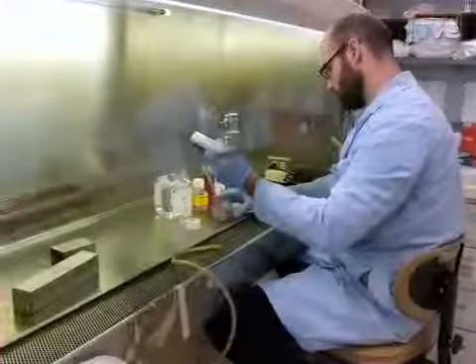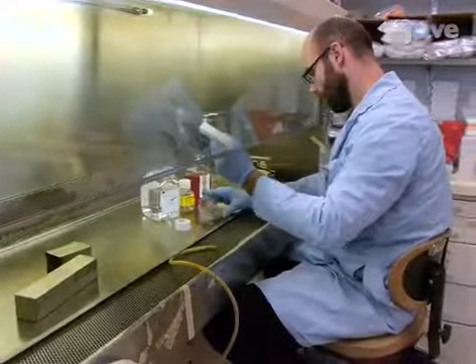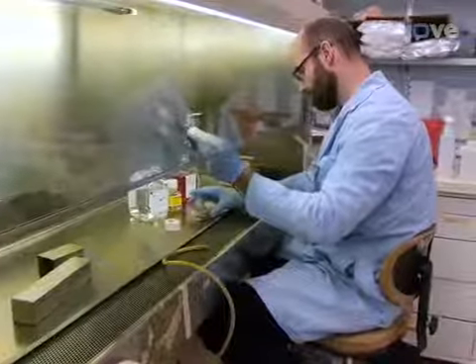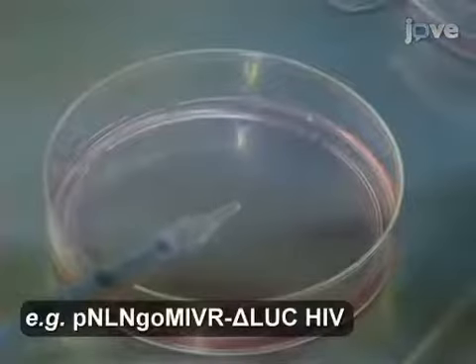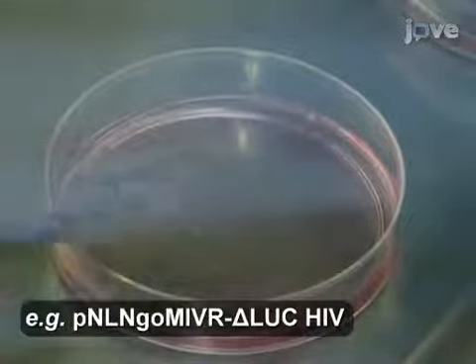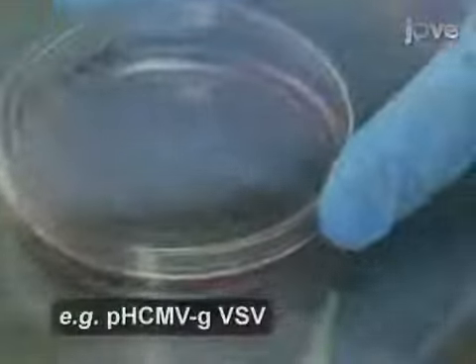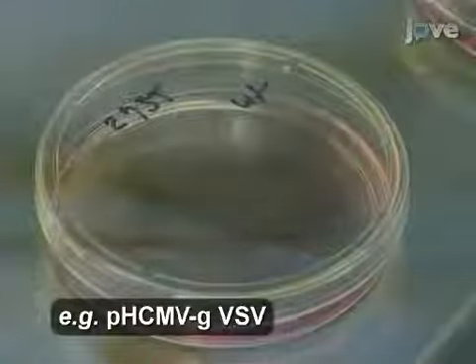On the day prior to transfection, plate 293 cells on 100 mm dishes at a density of 1,500,000 cells. On the next day, transfect the cells with 16 micrograms of wild-type or mutant HIV and 4 micrograms of VSV using the calcium phosphate method.